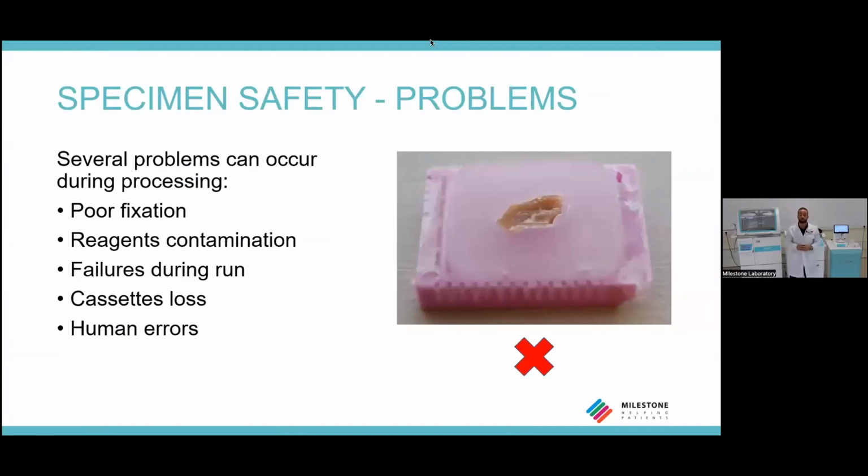There could be a poor fixation that can damage tissue, leading to a bad slide preparation, such as holes and difficult pickup during the cutting phase, and difficult diagnosis. There could be reagent contamination that can also affect the specimen, causing trouble depending on which kind of contamination occurs, that can irreversibly ruin the tissue.